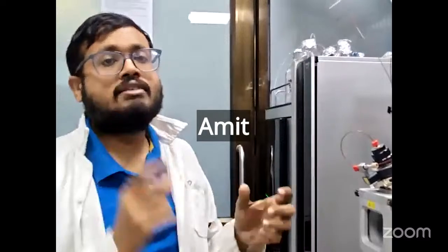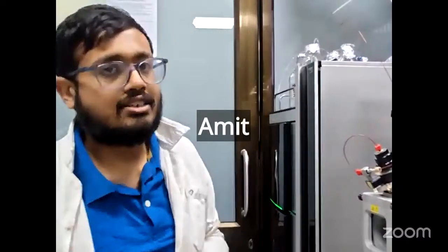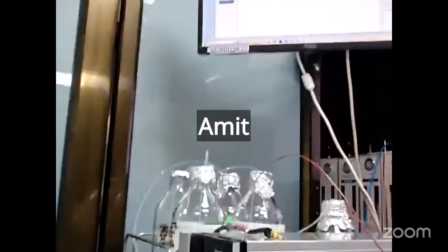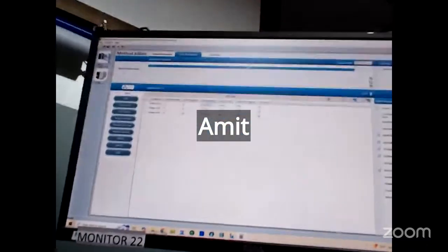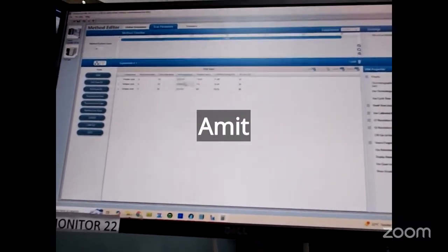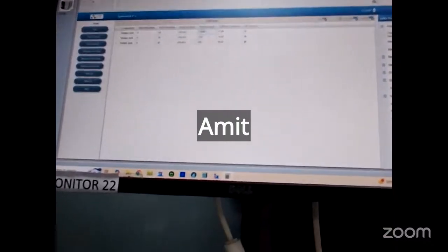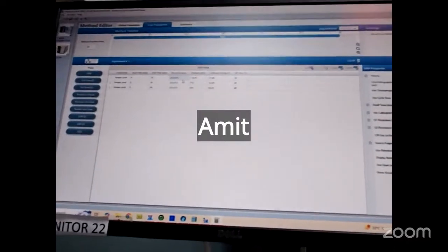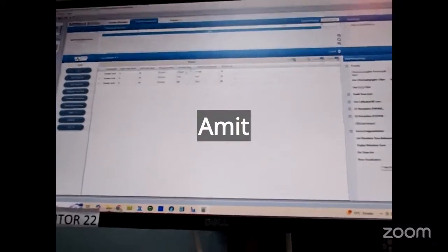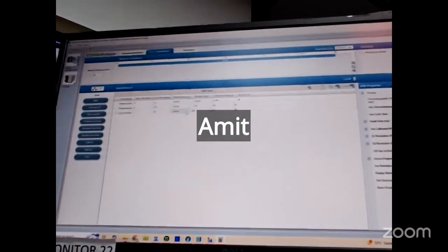But when we are going for the targeted approach, we need to monitor both the precursor and the product ion. That is known as a transition. If I can show you in the method, you can see that we are giving both the precursor and the product, so these are two transitions. The first quadrupole filters out this particular precursor m/z, and then after passing through the collision cell, where we give the collision energy voltage, it tries to find the particular product m/z. These two transitions will be monitored for a particular compound or peptide.